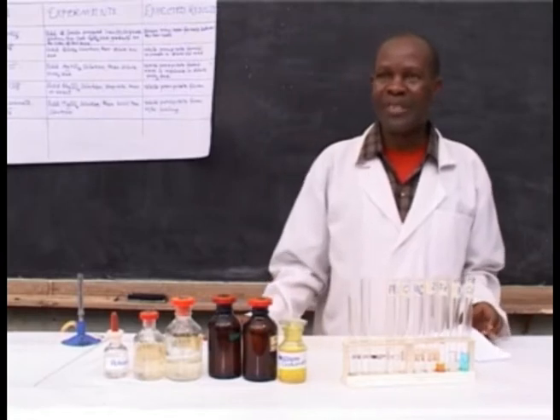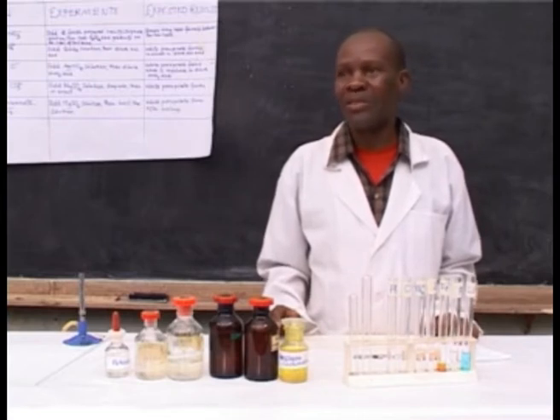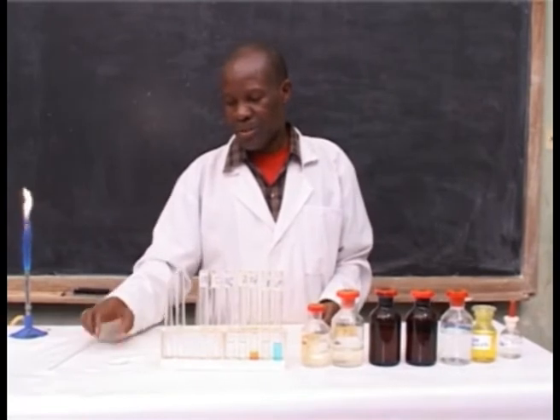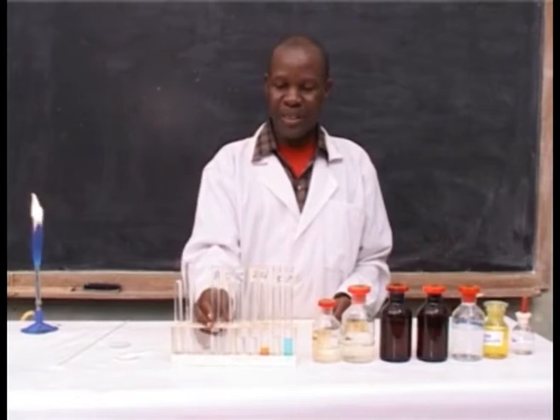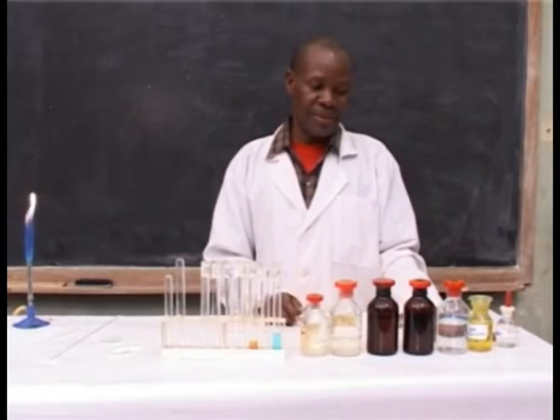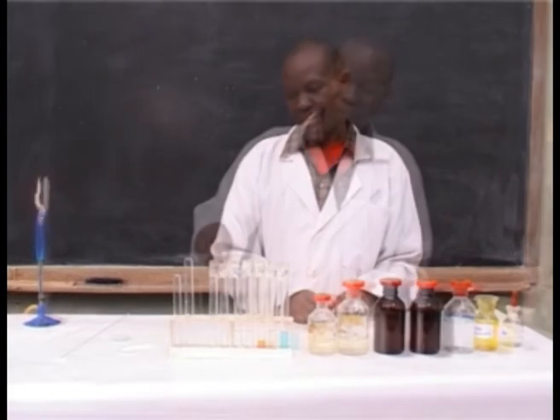The aim of this experiment is to confirm the suspected cation by the addition of a specific solution into a given salt solution. Requirements: glass rod, watch glass, test tubes containing the suspected cation solutions. The reagents stand for the chemicals used to test the suspected cation.